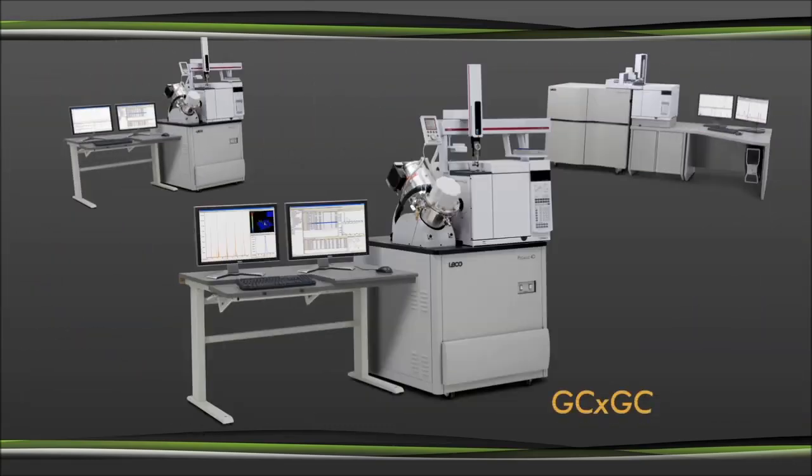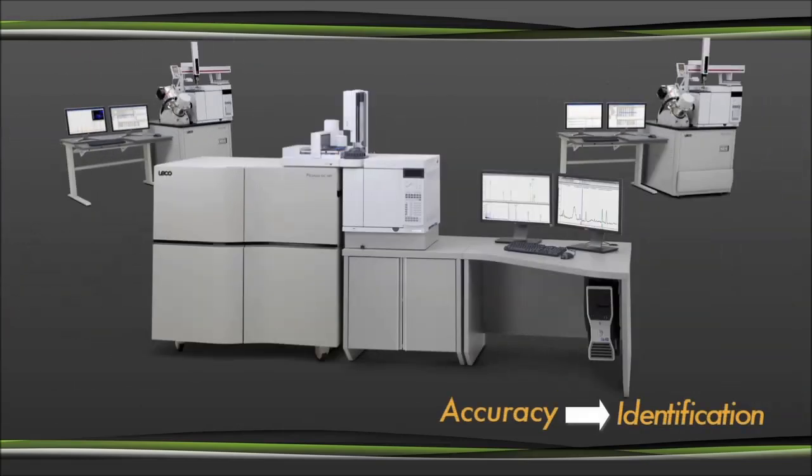Discover double the analytes with the Pegasus 4D GC by GC-TOF-MS. Increase confidence in your results with the industry-leading accuracy and resolution of the Pegasus GC-HRT.